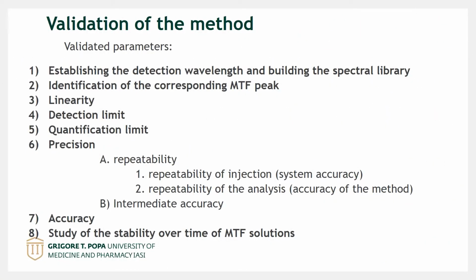The validated parameters were establishing the detection wavelength and building the spectral library, identification of the corresponding metformin peak, linearity, limit of detection, limit of quantification, precision, accuracy, and stability studies for metformin hydrochloride solutions.